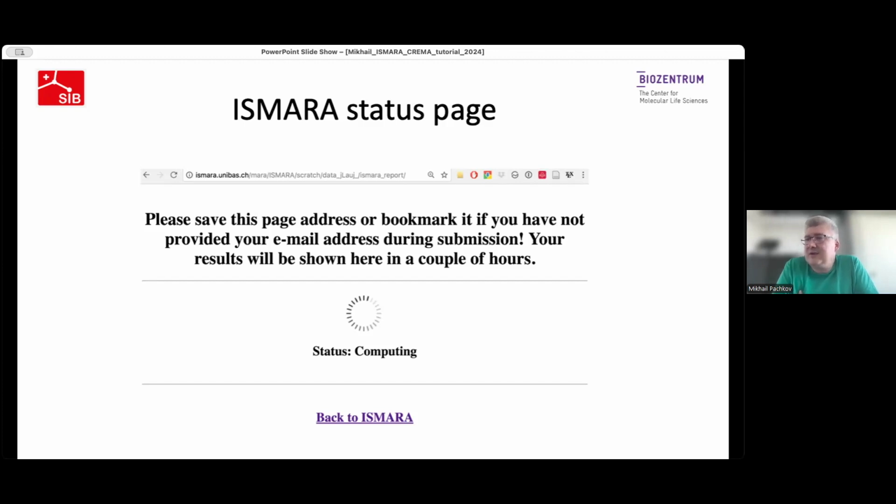People who submit data with an email address will get an automatic notification once the analysis is finished. If no email address is provided, the only way to see the status of the job and see results when the analysis is finished is to check the URL of the status page.